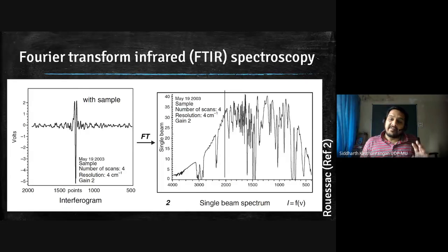If you have a sample which has a very broad wavelength, meaning a broad bandwidth, that is, it covers all the frequencies, then you will get disappearance of the fringes almost everywhere, as you observed in the experiment last time. And that is what you are observing here, that everywhere the intensity is close to zero. There is some oscillatory structure, but it is close to zero.